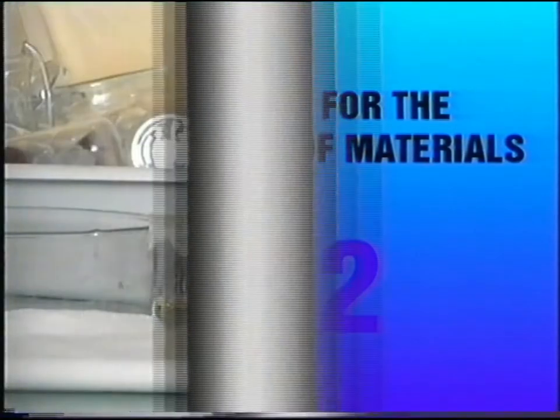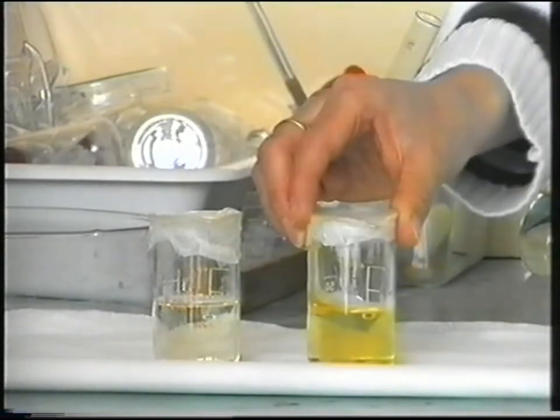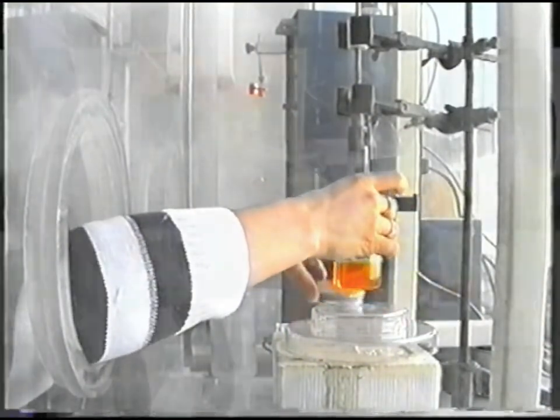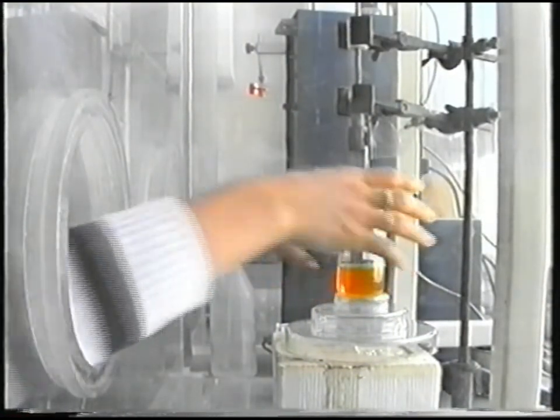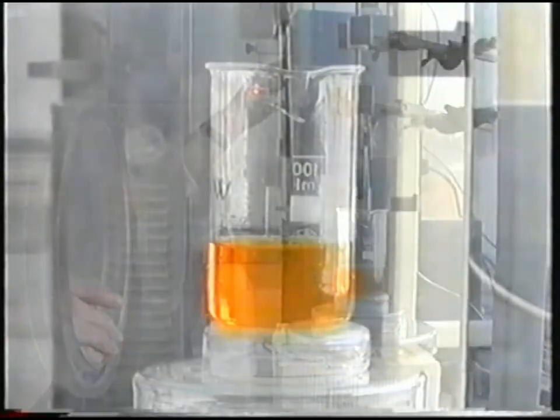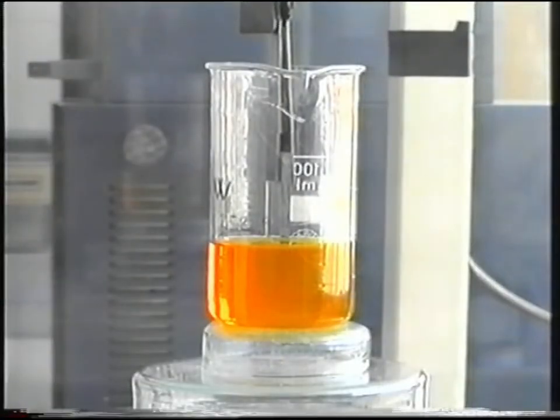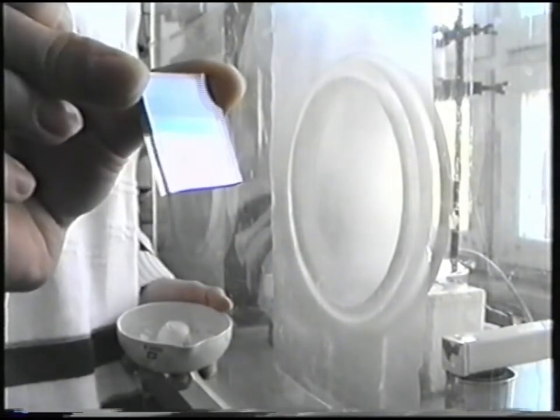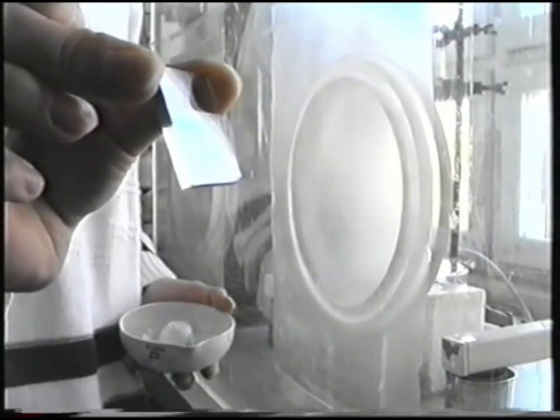Research within the laboratory for the spectroscopy of materials is oriented towards the synthesis of materials in bulk and thin film form which exhibit various optical, electrical and mechanical properties. Sol gel processing combined with a dip coating technique is used for the preparation of electrochromic ion storage films and organic inorganic hybrids with ionic conductivity.